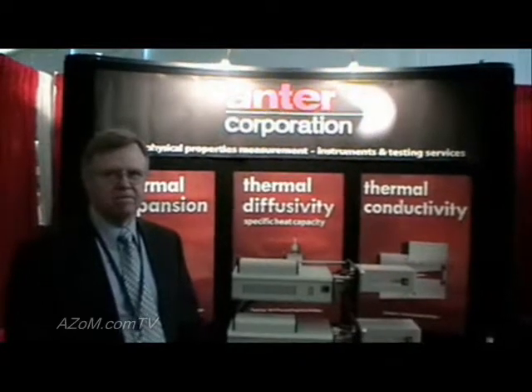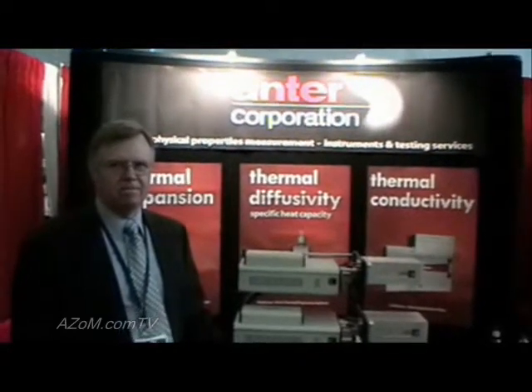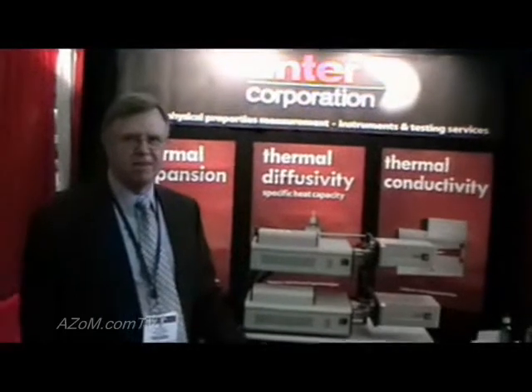This is Cameron Chai from AZoM.com and I'm speaking to Bob Purvis from Anter Corporation. I'd like to introduce our Unitherm 1000 series dilatometer.